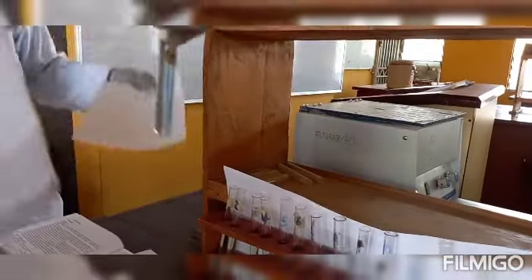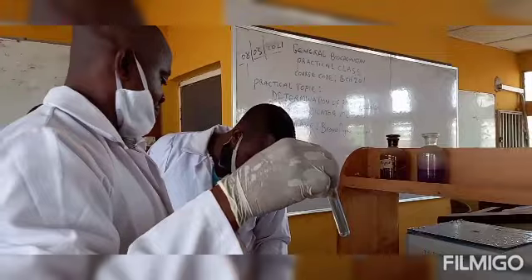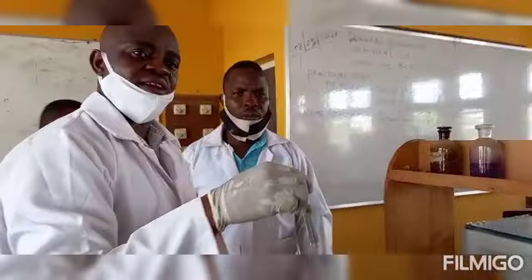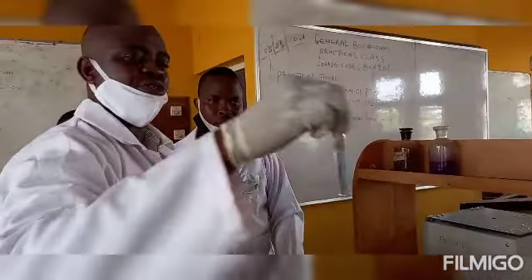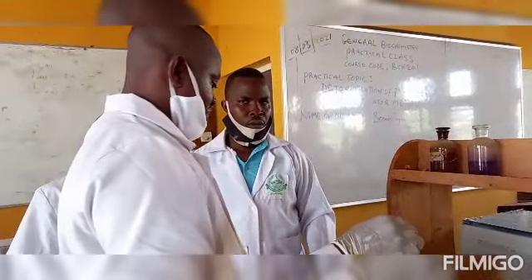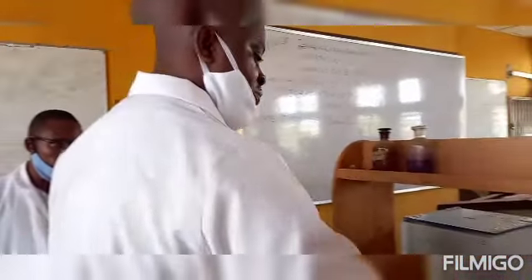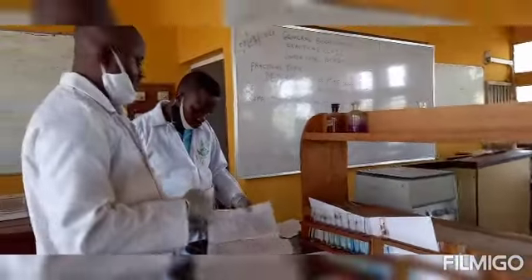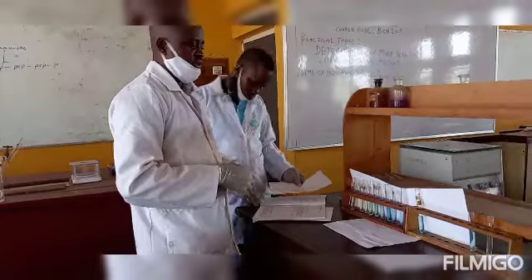So you now go back to your manual. Tube 7 is having what pH? Tube 7, according to our standard table, is 7.2. So that means the saliva we used for this procedure has a pH of 7.2. Ladies and gentlemen, this is how to use an indicator in the laboratory to determine the pH of an unknown solution.